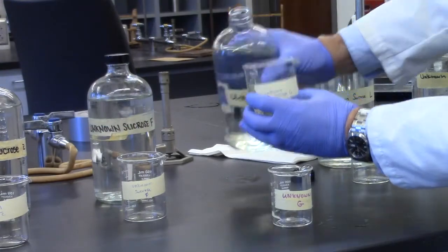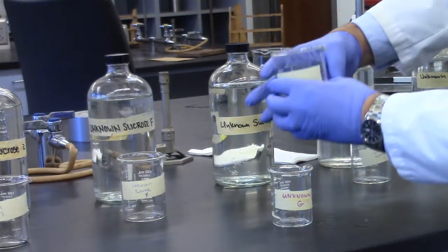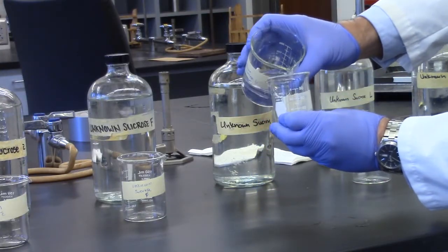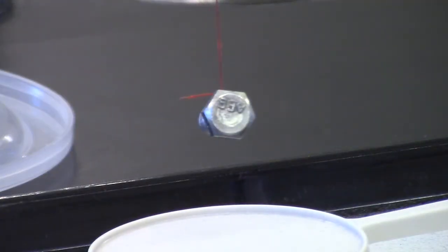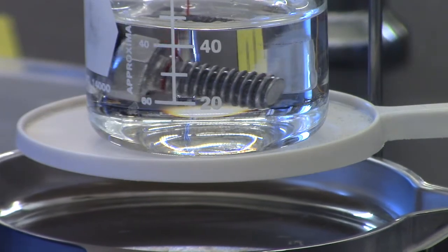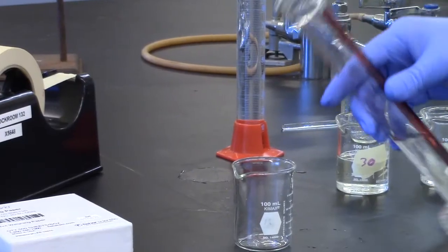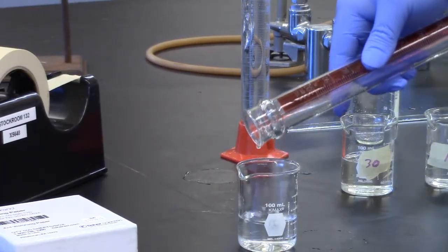Obtain about 60 mLs of your unknown and record the number or letter of your unknown solution. Select the sinker. Tie a thread to the sinker so that when hanging free, it will be level. The lines should be long enough so that the sinker may be submerged in the solutions or pure water. Fill a 150 or 100 mL beaker about halfway with distilled water.